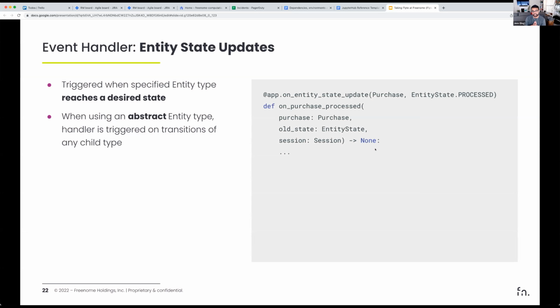our production pipeline is a really, really complex one, right? What's happening is that we receive these blood samples. We extract molecules from these blood samples, different sorts of analytes. And then these analytes all get processed asynchronously. They go off into their own track of analysis and pre-processing. Once all of these finish, possibly at all different times, their data will land separately in GCS or in object storage, right? And so we're kicking off independent analyses of these analytes when they arrive.